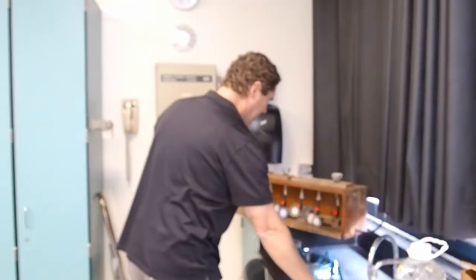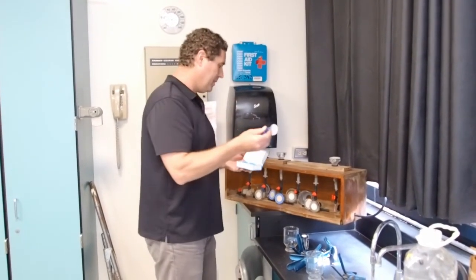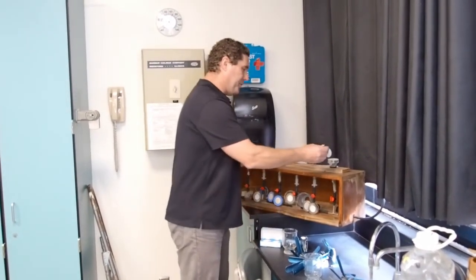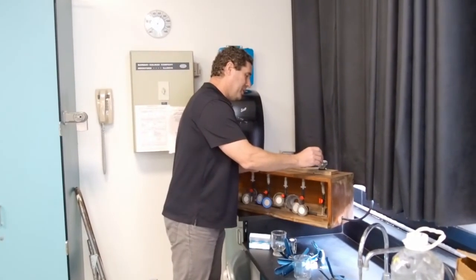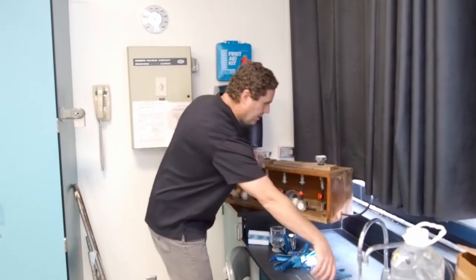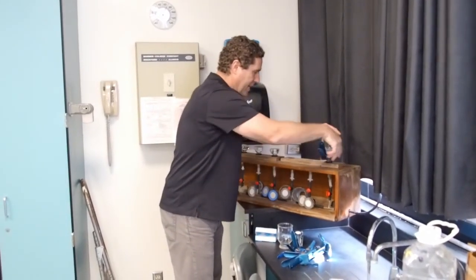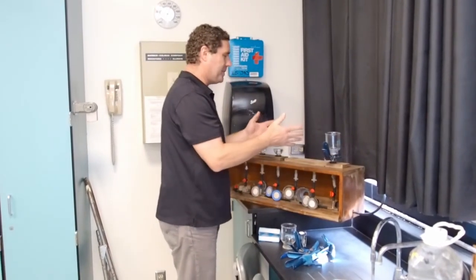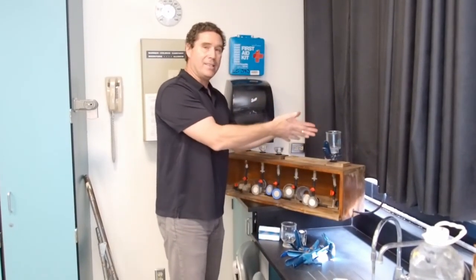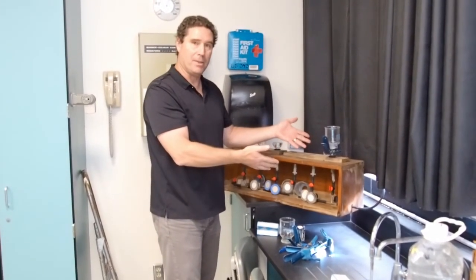And so the way we use this is we take our glass fiber filter. We're going to pick it up using tweezers so we don't get the oil from our hands on it. And we're going to go over here to our filtering apparatus, put this down, and then we're going to attach our glass cup and lock that down on there like that. Now we have something we can pour the water into on top of the filter. The water can go down through the filter, leaving us with our phytoplankton.